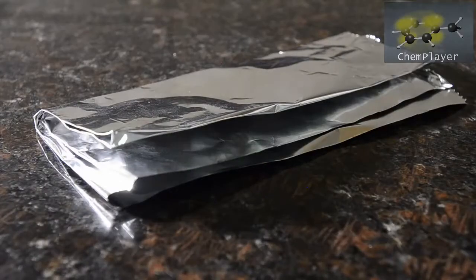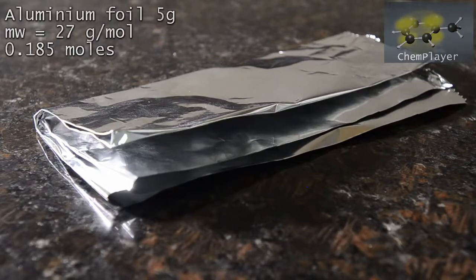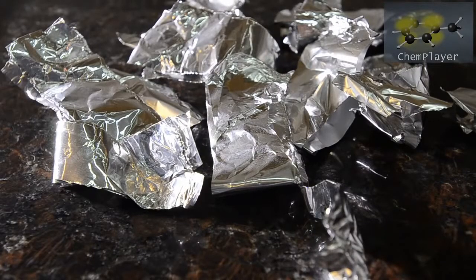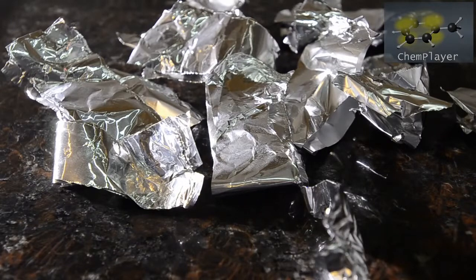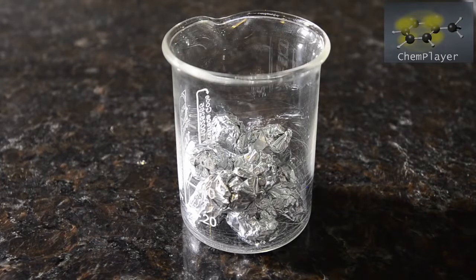Now for our aluminum foil, we've got a layered sheet here which weighs 5 grams. This should be an excess given that one atom of aluminum should react with three atoms of iodine. We cut it into strips and then rolled them into little balls so we can easily add to the reaction mixture.